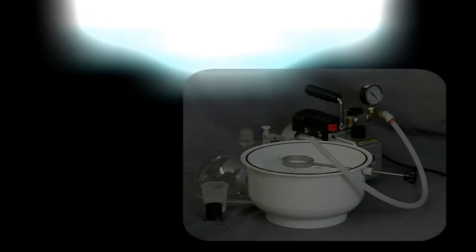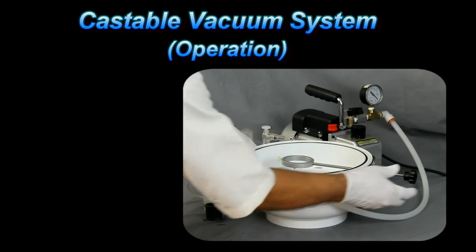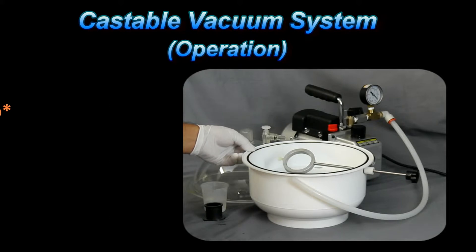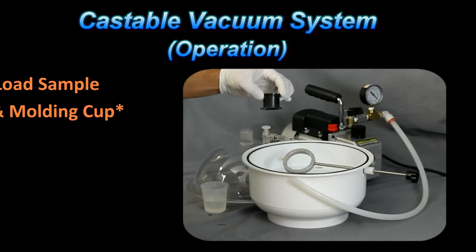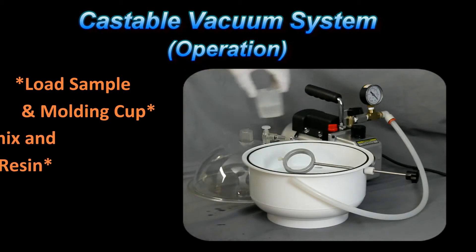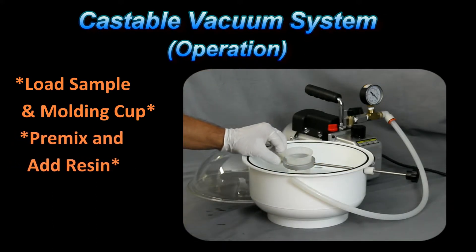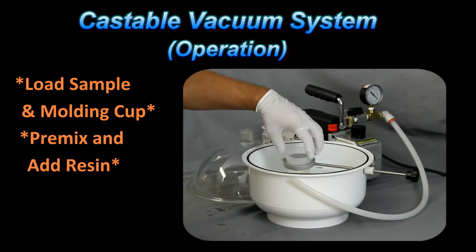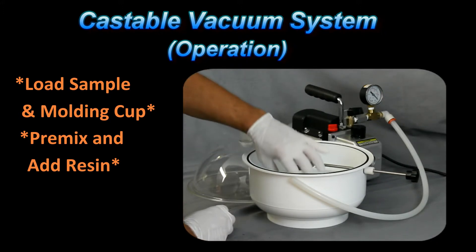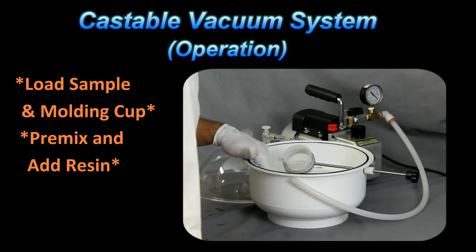Mounting with the castable vacuum mounting system: this system is set up with an adjustable arm that allows us to pour multiple samples at one time. Taking our sample and our mounting cup, we'll place that into the chamber. We'll take our pre-mixed resin, put that into the chamber, and tighten the screw down so that the resin is securely in place. We want to make sure that our molding cup is aligned so that when we're pouring, we're pouring into the cup and not all over the chamber.